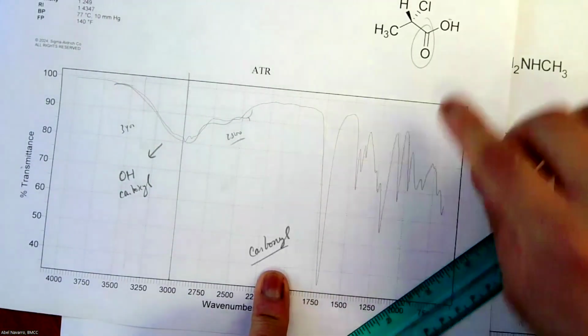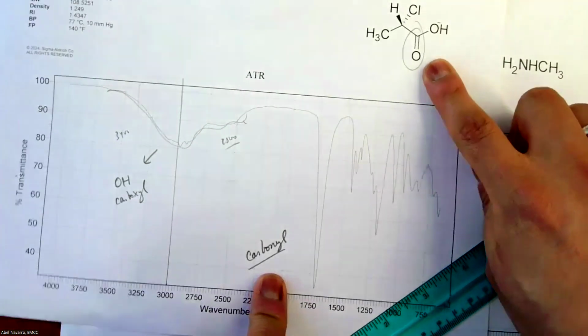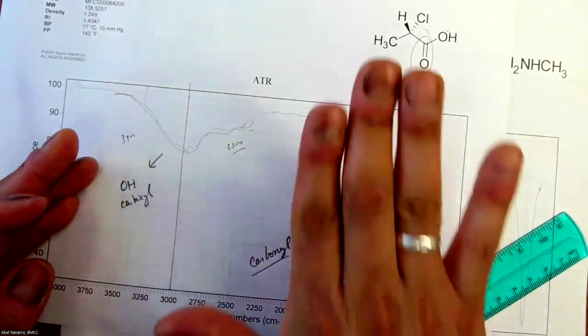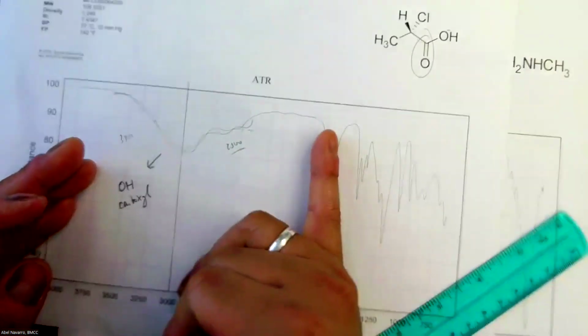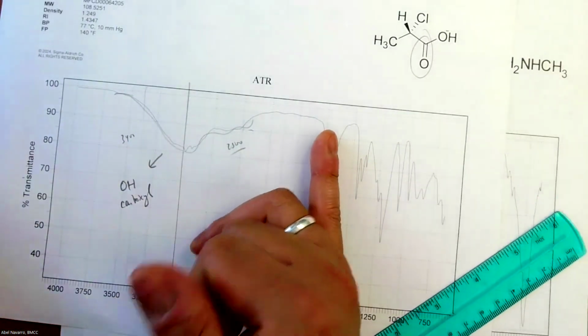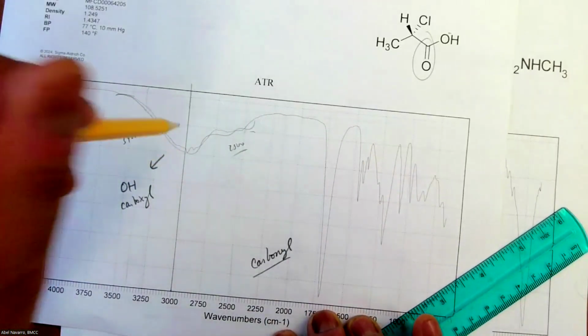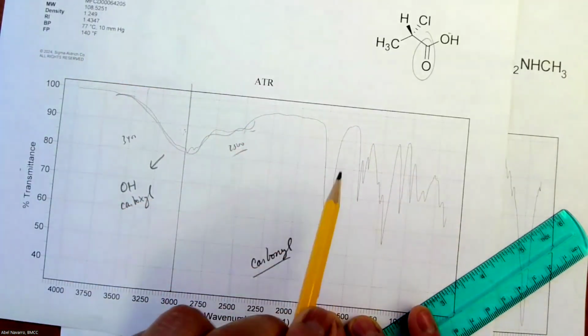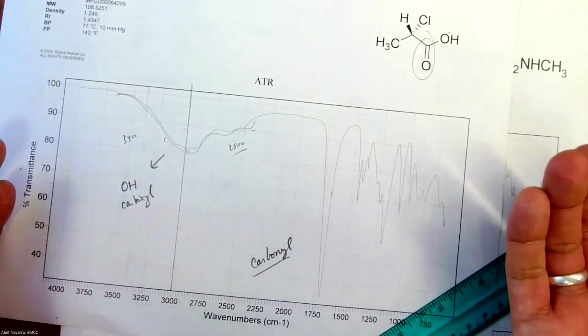And then the carbonyl, of course, is present, and that's the only indication. Can I see an OH peak like that, and this one absent? No way. A carboxylic acid needs to have that distortion and the COO. If you don't have both, then you don't have a carboxylic acid.